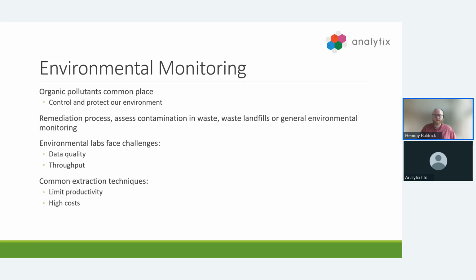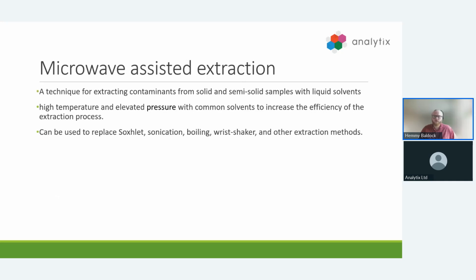Today, we're going to focus on the extraction of pollutants from solid matrices. This is often performed with techniques that offer limited productivity and have high operating costs. Solvent extraction is the least evolved and most error-prone step in pollutant analysis, with many methods using this technique dating back to the 1800s. A way to overcome these challenges is by utilizing microwave-assisted extraction. This is a technique for extracting contaminants from solid or semi-solid samples using a liquid solvent.